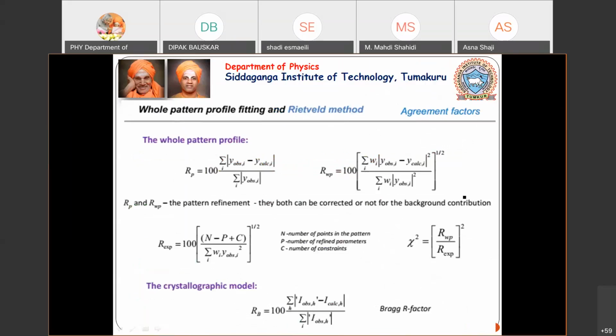Next, some of you were asking what the Rwp should be. For this, you should know what your Rwp and your Rp are. Rp refers to your residual profile: R refers to residual, and P means profile. So how do we know the residual profile? This is the formula that is normally used.